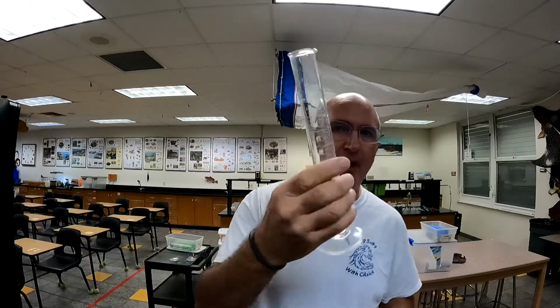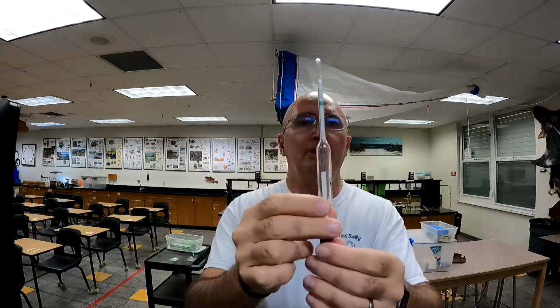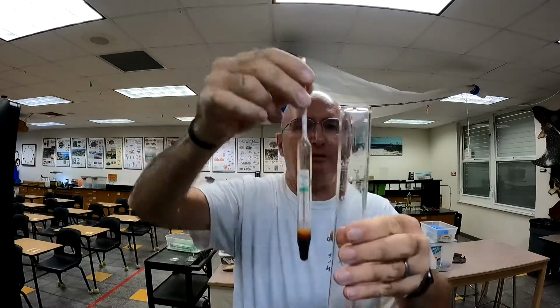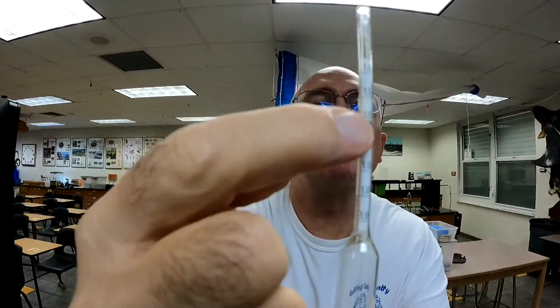The second method you're going to do is specific gravity. You'll need a 100 milliliter graduated cylinder and your sample of water. So you're going to add the water till you fill it up. And you're going to need the hydrometer. You're going to place your hydrometer into the graduated cylinder very gently, like this, and eventually it will float in the water. And if you look right here, you can see there's a little scale.